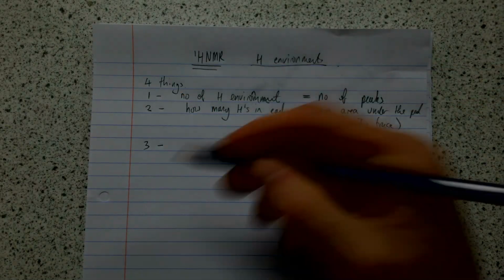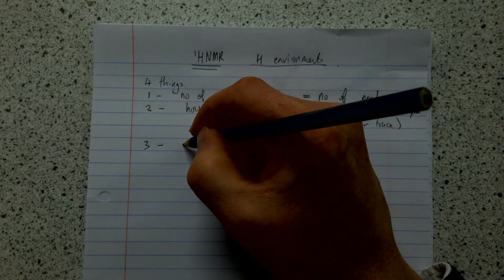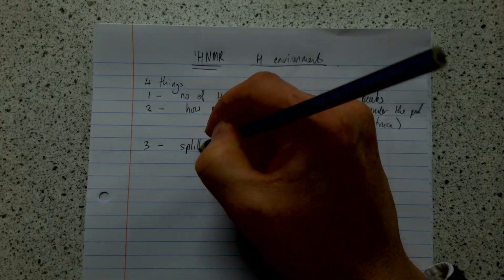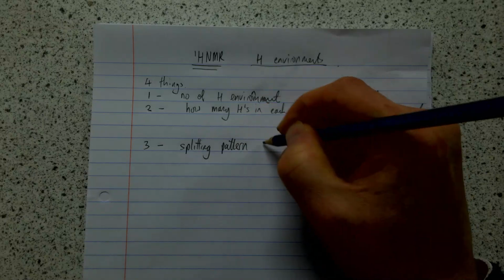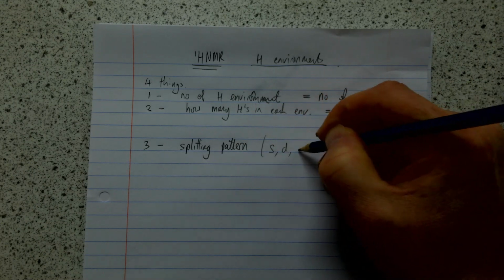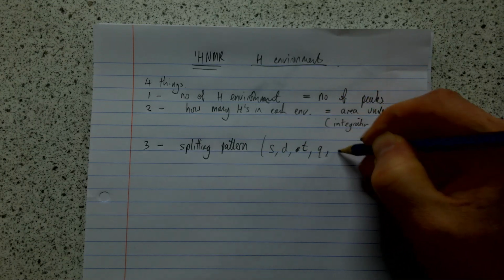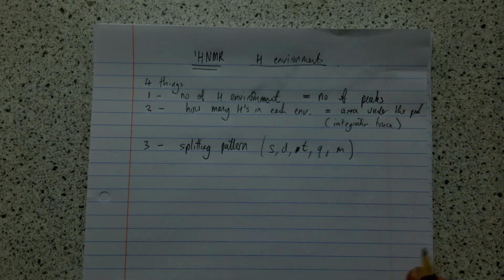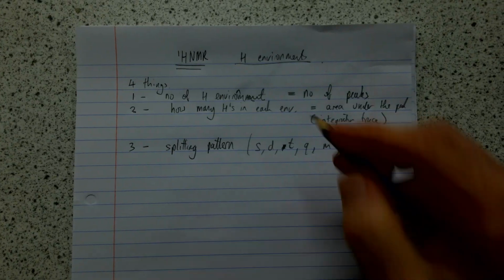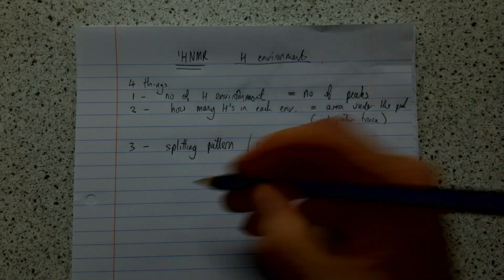The third thing for each peak, or the second thing for each peak, but the third thing you need to remember is something called splitting pattern. And that's either going to be a singlet, doublet, triplet, quartet, or multiplet. It's going to be one of those 5 things. If you're really stuck, you can guess one of those. And we'll explain that. It's all to do with the number of hydrogens on adjacent carbons. We'll see when we get there.